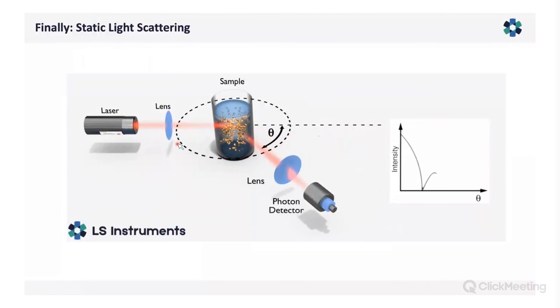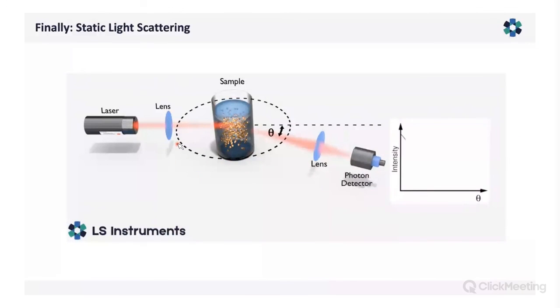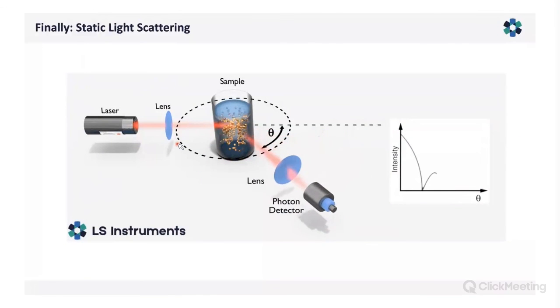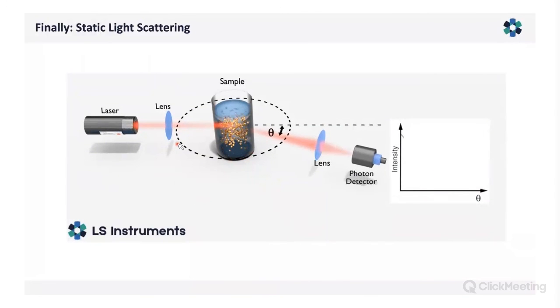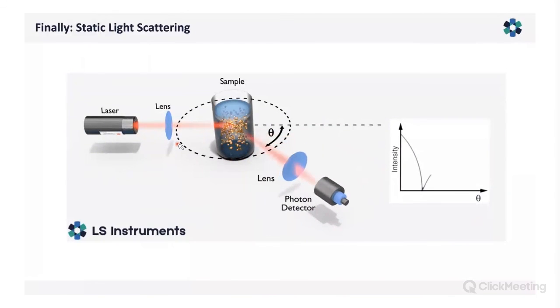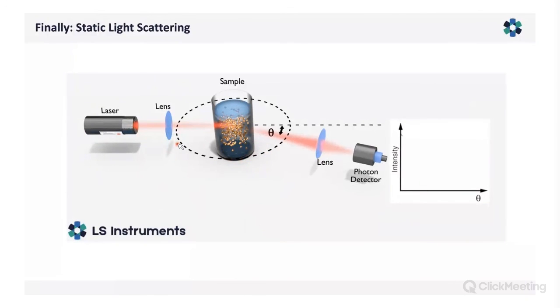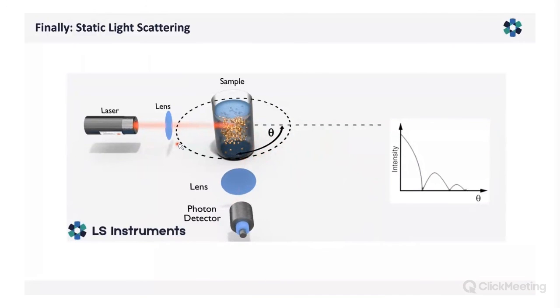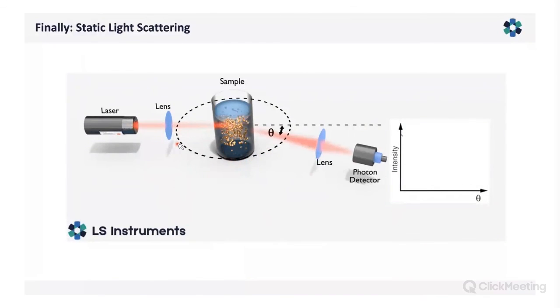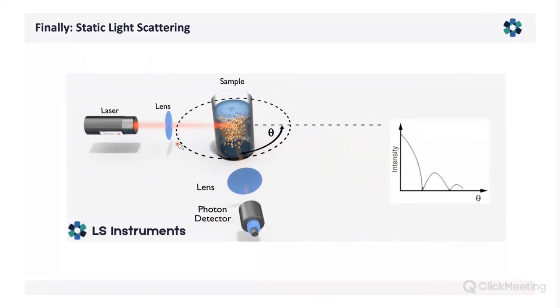And from this, you get something like the shape form factor of the suspended particles or objects, polymers or particles. Therefore you can get the size and size distribution, and you take the intensity average. So in a classical experiment, you would not look at fluctuations like in dynamic light scattering, but simply at the average intensity as a function of angle.